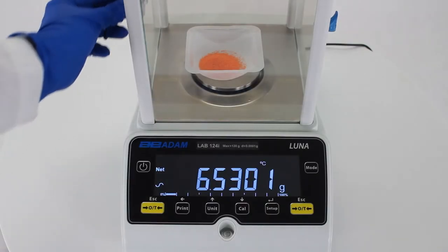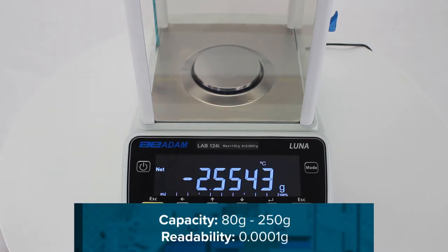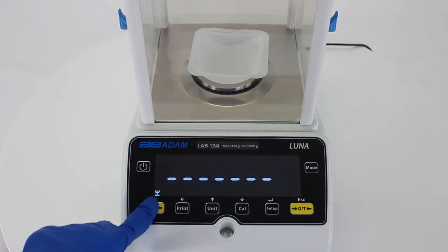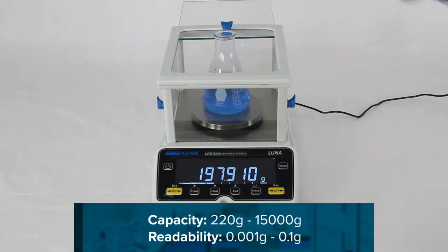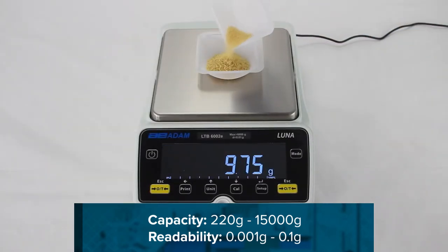LUNA's analytical balances offer capacities from 80 grams to 250 grams with a readability of 0.0001 grams. Precision LUNA balances boast an impressive range of capacities from 220 grams to 15,000 grams with readabilities from 0.001 grams to 0.1 grams.